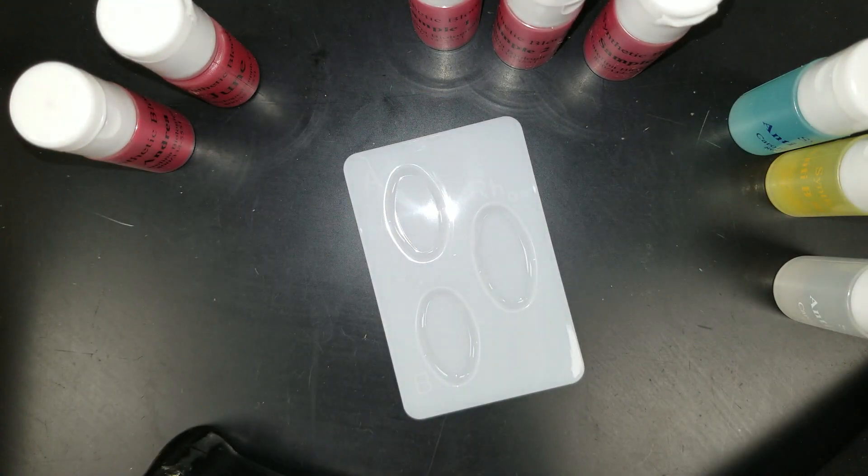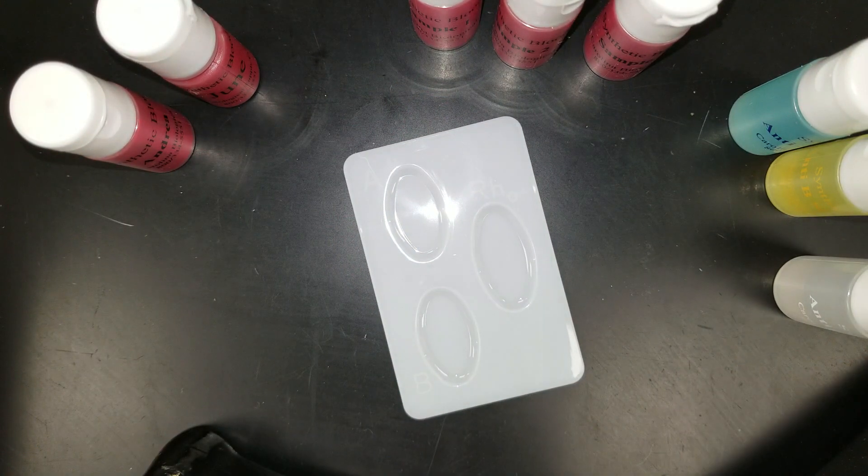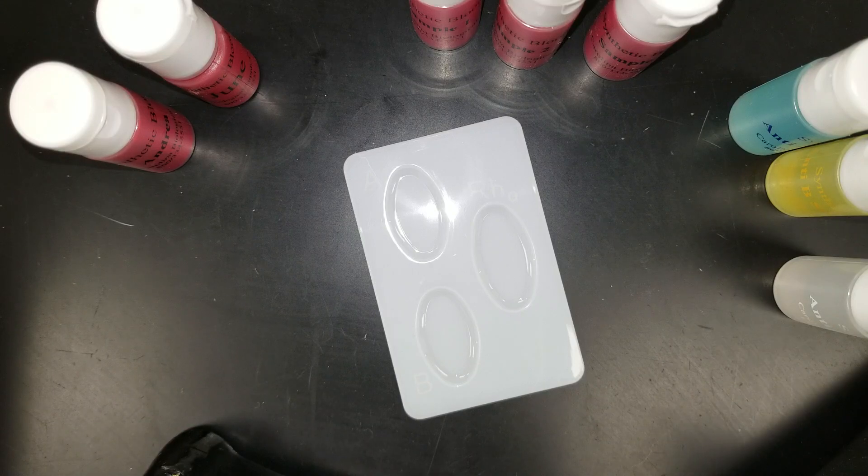All right guys, I just wanted to do a quick video to show you what your results should look like when you're doing your blood lab today.